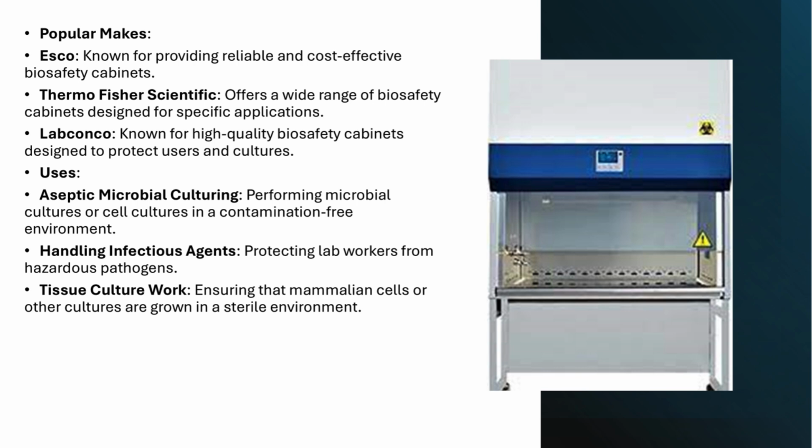Aseptic microbial culturing. Biosafety cabinets are essential for aseptic microbial culturing. They provide a contamination-free environment, allowing scientists to grow bacteria, fungi, and other microorganisms without the risk of external contamination. Handling infectious agents. They also protect lab workers when handling infectious agents, especially in clinical settings where exposure to harmful pathogens can pose serious health risks.